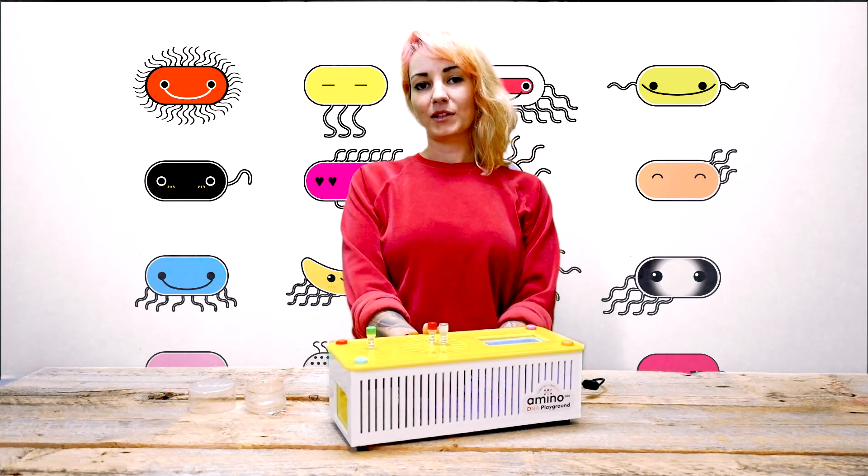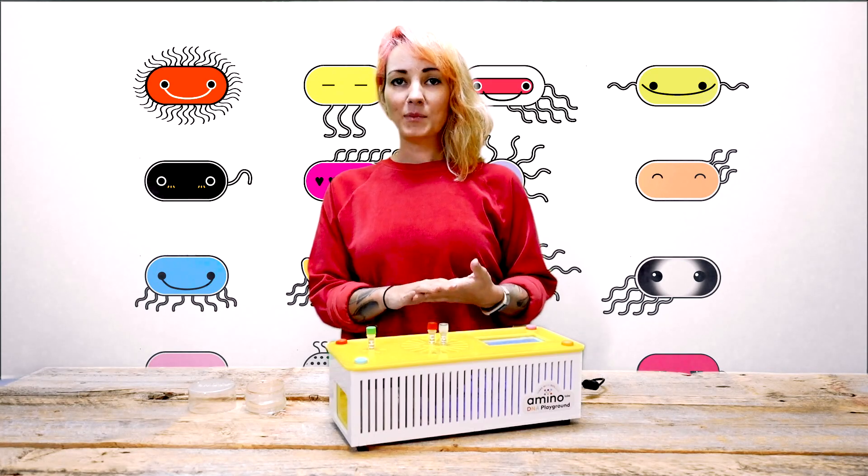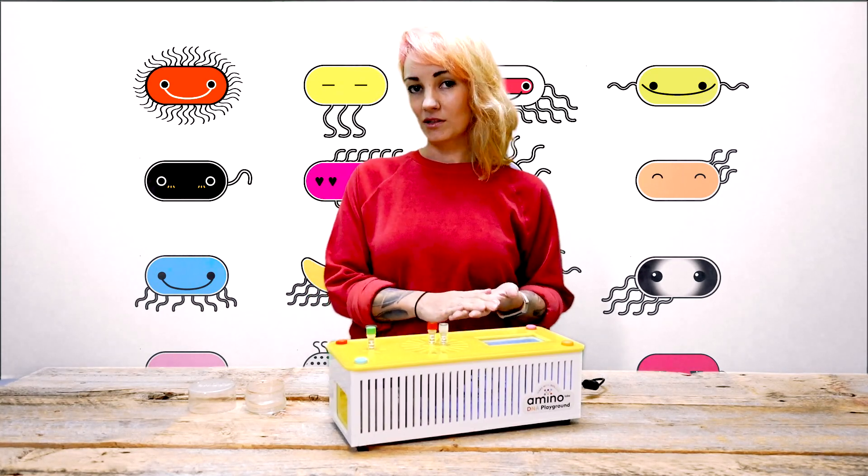The DNA Playground works great with our ecosystem of kits, but you can also use it for your own experiments because it's a multi-purpose tool.